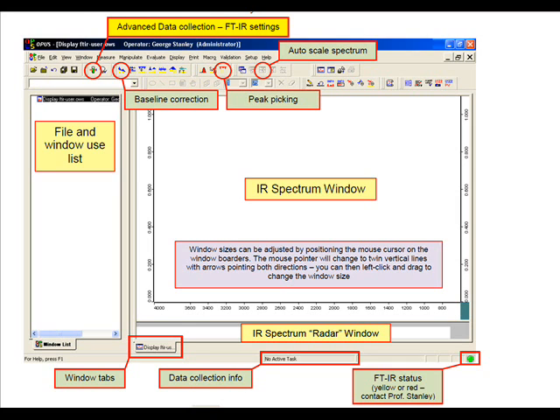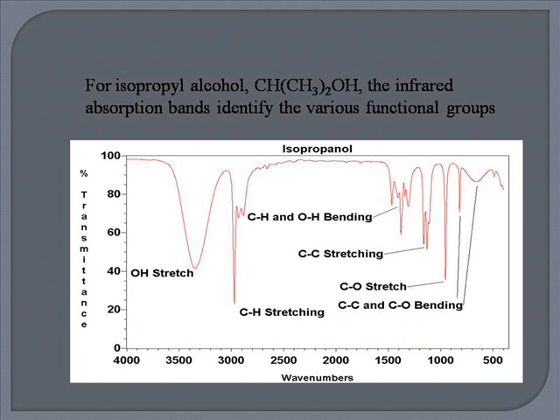A background spectrum must also be measured. This is normally a measurement with no sample in the beam. This can be compared to the measurement with a sample in the beam to determine the percent transmittance. This technique results in a spectrum which has all of the instrumental characteristics removed. Thus, all spectral features which are present are strictly due to the sample.